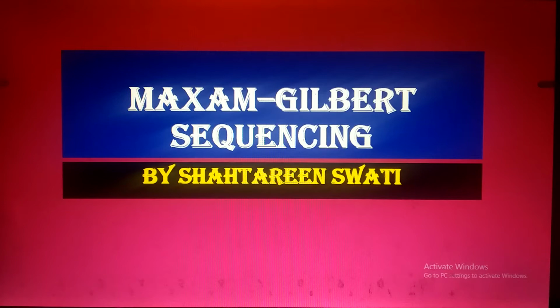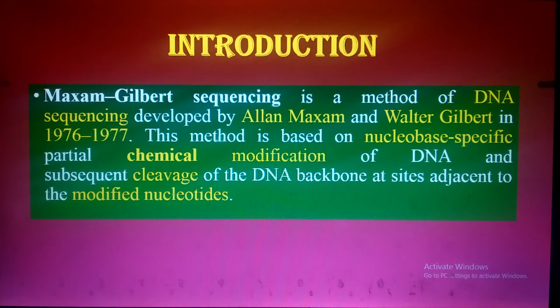Okay, now I am going to give you a little bit of information about the history of the Maxam-Gilbert method. Why is it called the Maxam-Gilbert method? Because it was discovered by Maxam and Gilbert. So in their honor, the method was known as the Maxam-Gilbert method.